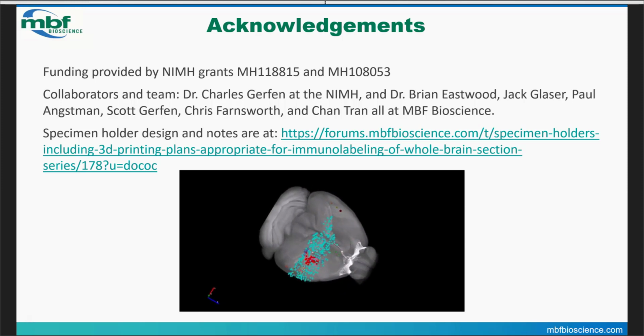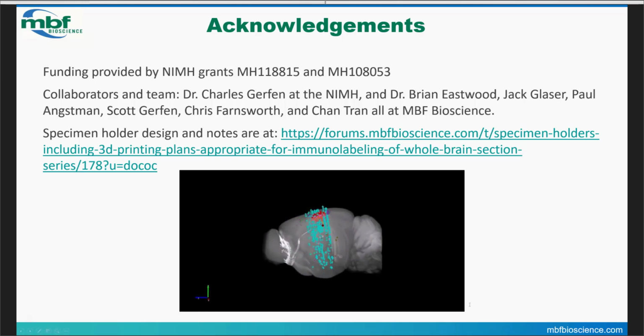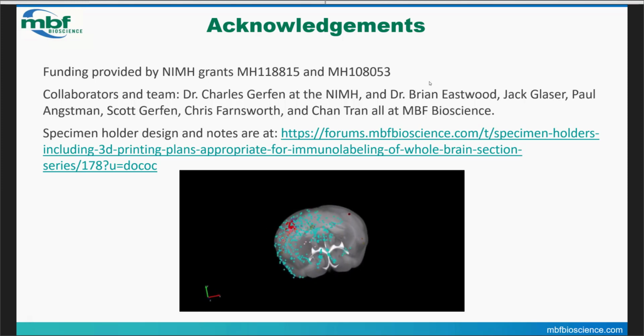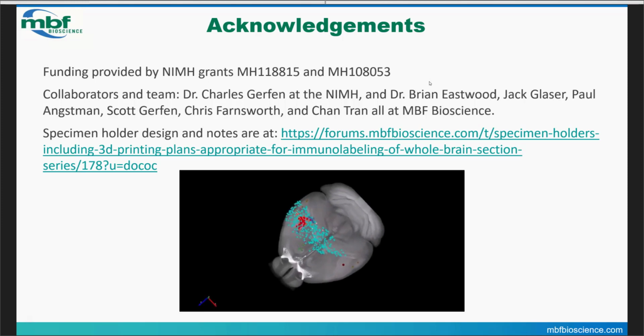A couple other questions. Brian, we got a question: what about bright field? Yep, bright field is handled, no problem. We work with a bunch of labs that do bright field imaging, and we've done reconstructions with those as well. That's because you're using a transform that can handle multiple modalities, right? Whether it's confocal or bright field. Yeah, in this particular instance, the image registration procedure can work with either bright field or fluorescent images, just the same. Okay, cool.